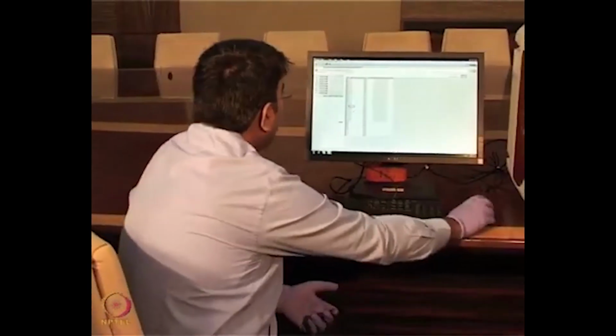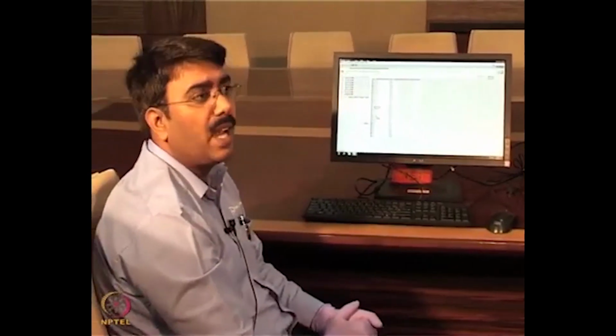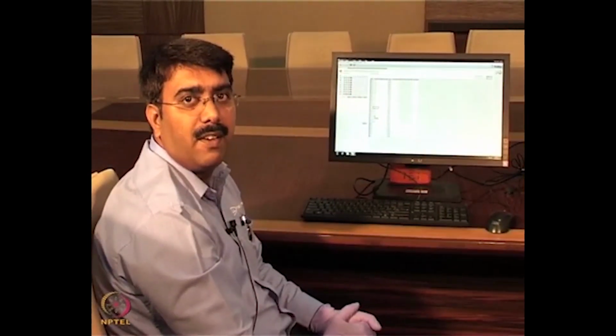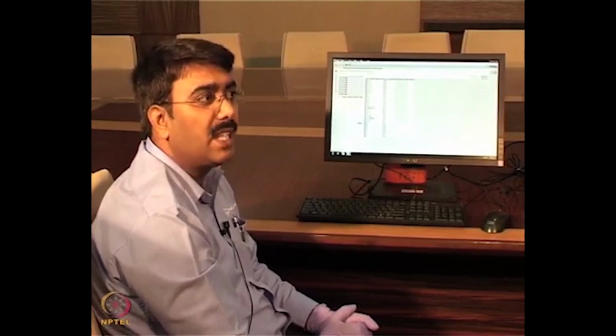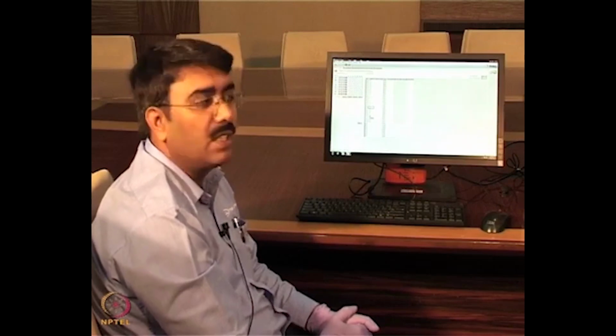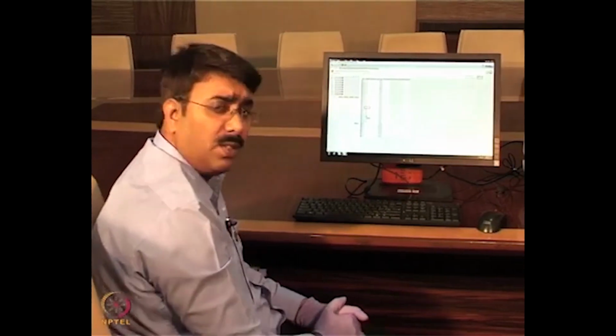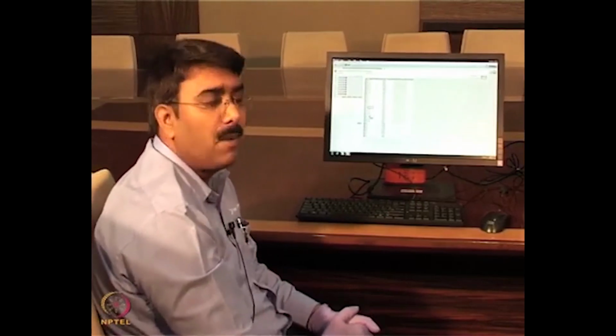Here, as I mentioned, the buffer can be any kind of buffer. In this experiment I am using a PBS buffer with additives: 0.1% BSA, as well as a surfactant, 0.02% Tween 20. So this composition is in PBS at pH 7.2.